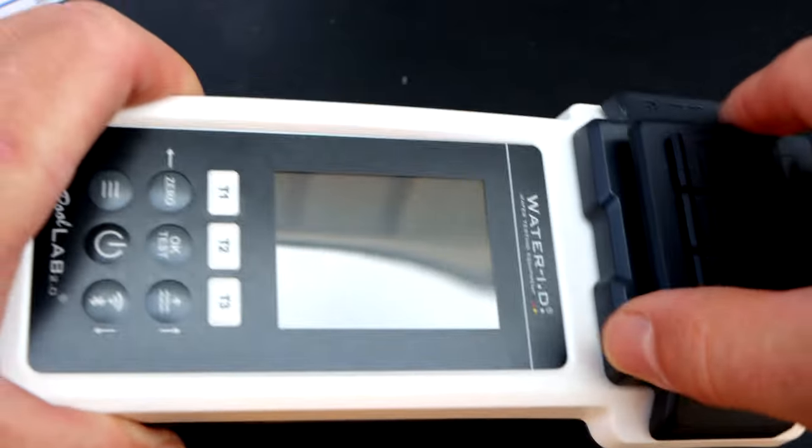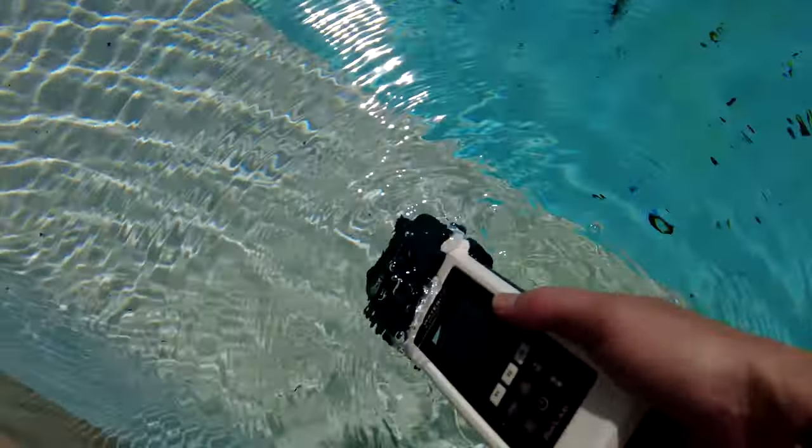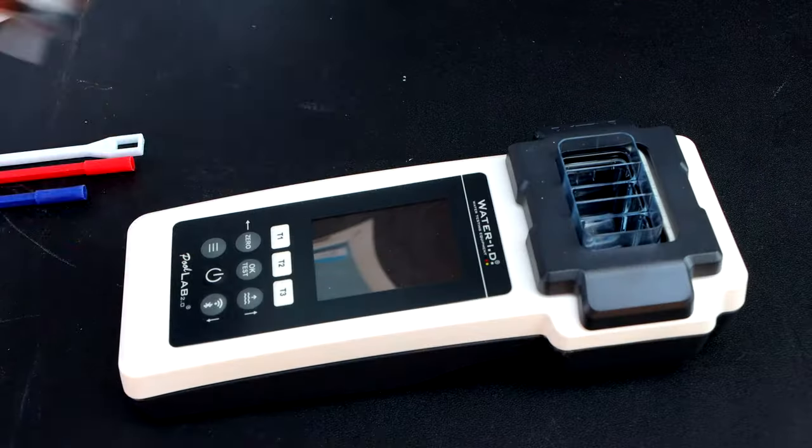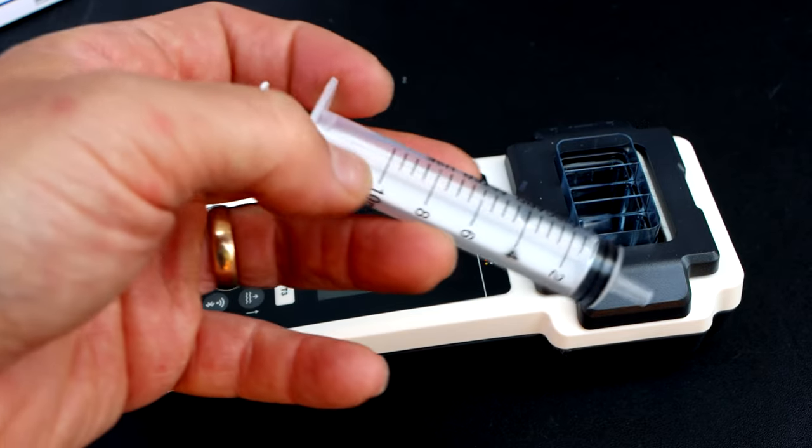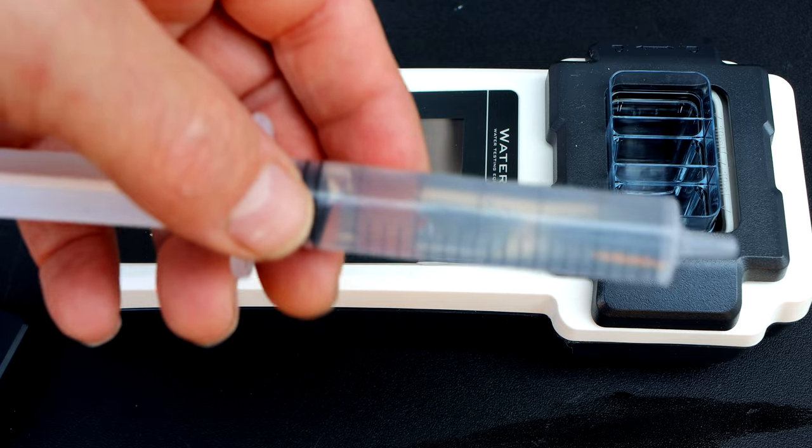The testing unit is completely waterproof, so you can get the water sample by dipping this into the pool or you can use this syringe to get the sample water.